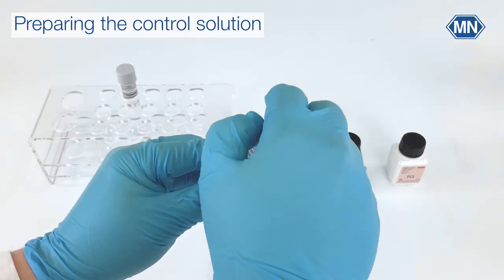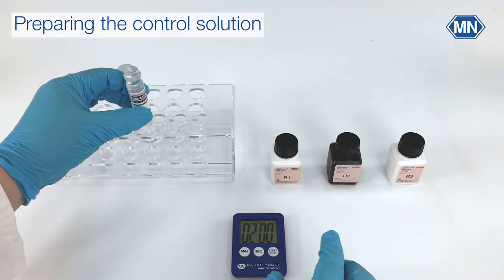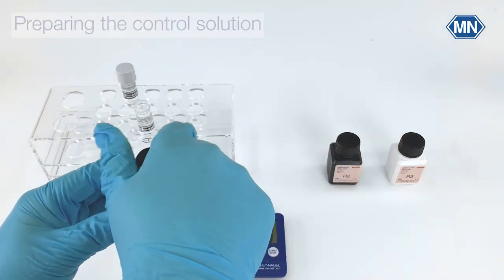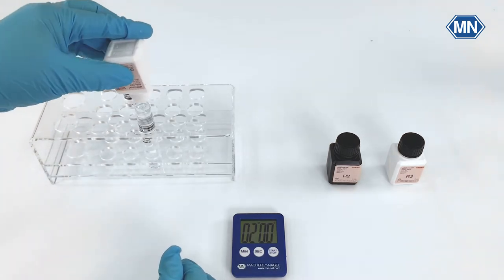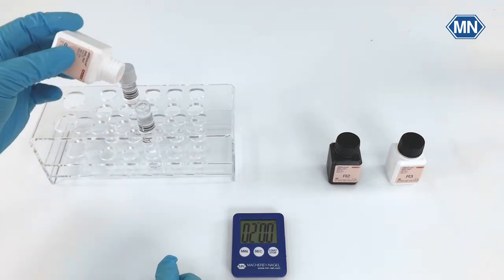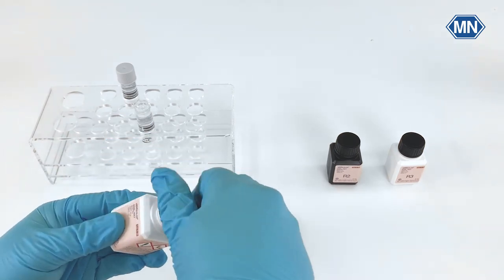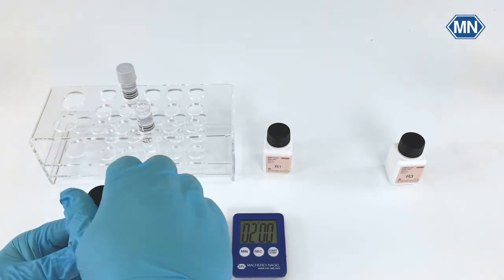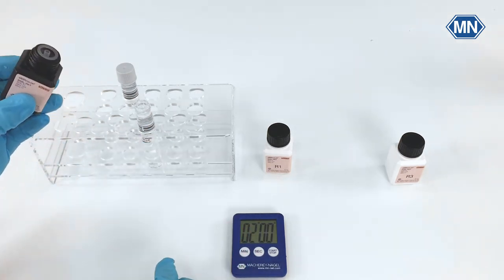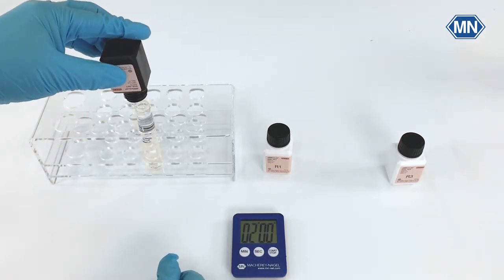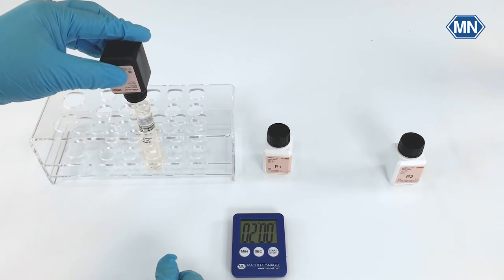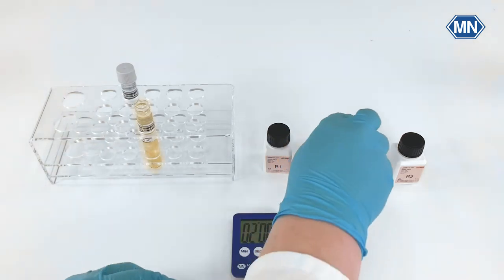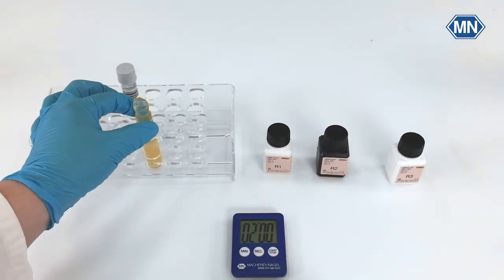Open the test tube and add two drops of R1. Also add two drops of R2. Close the tube and shake it.